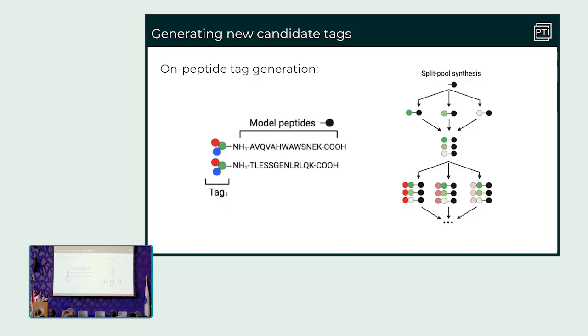And you can see here that each of these tags contains 3 components. In green, we have a trifunctional building block. And then on top of that trifunctional building block, there were 2 spots where we could derivatize. So the red represents a carboxylic acid derivatization, and the blue represents a boronic acid derivatization. This allowed us to form a bunch of mass tags combinatorially, which was great because it allowed us to explore a sufficiently large chemical space with a relatively simple experimental design.